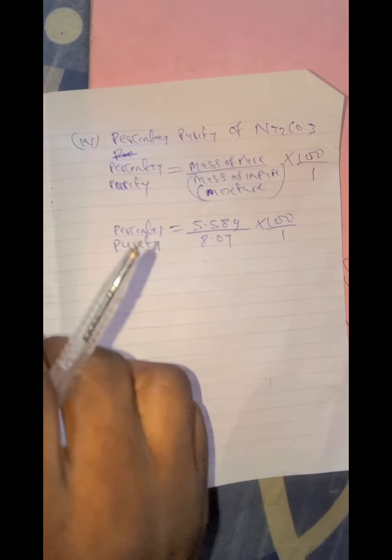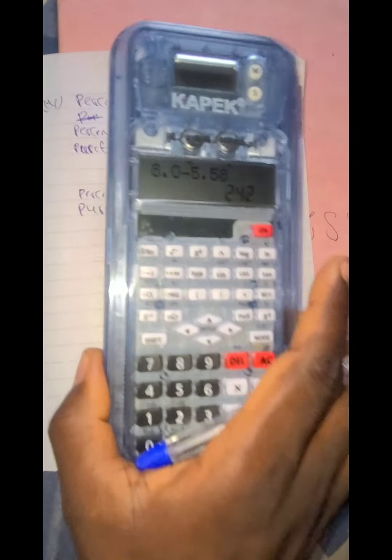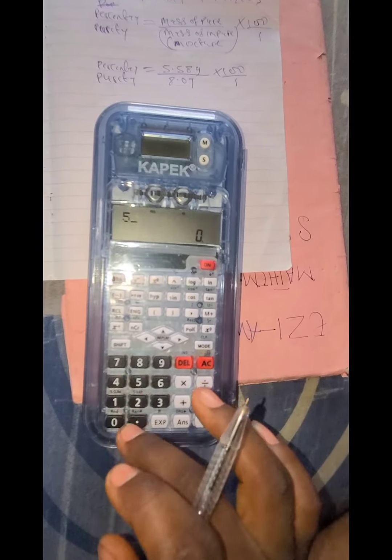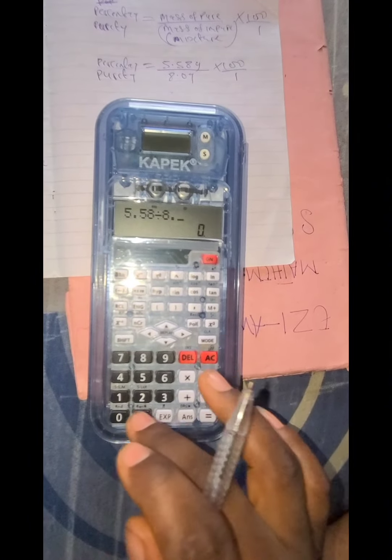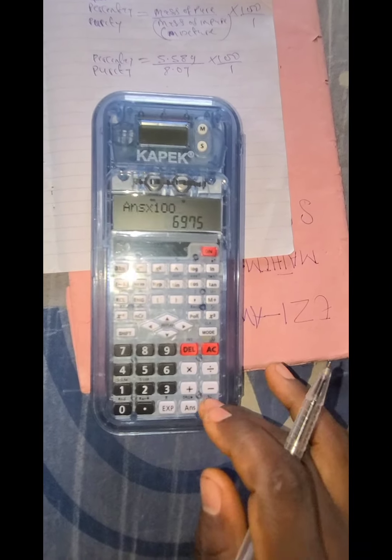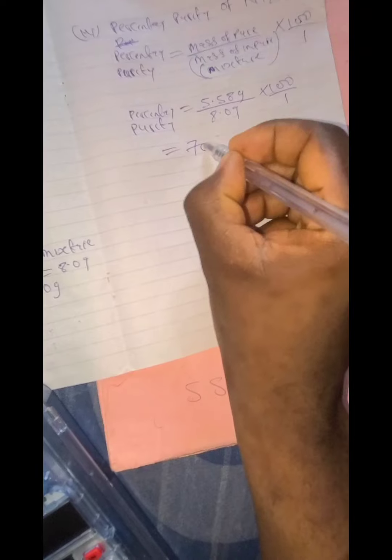So when you divide this, you will get, okay, let's do it. You have 5.58 divided by 8.0 times 100 to give you 69.75, which is approximately 70, so it will give us 70%.